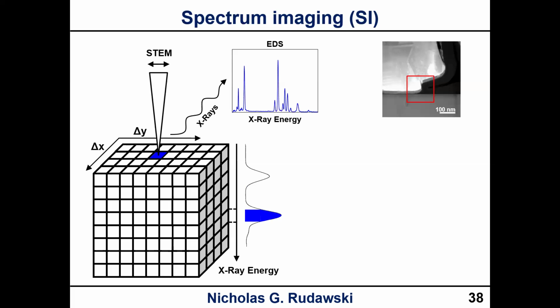I don't know what this is. You can see between the dashed lines, I'm integrating under the spectrum. You'll notice also that there's a little bit missing here. The blue doesn't go all the way down. The reason is that this is background, and you don't want to include that in your imaging. You want to remove that contribution.